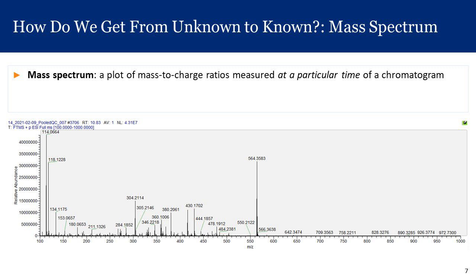And as I mentioned earlier, one of the great advantages of non-target analysis is really that we can detect large numbers of different compounds. But I hope it also becomes clear here how important it is to really take into account, are all these ions really coming from the sample, or are any of these ions potentially coming from any background, either from the analytical instrument or from the laboratory that we're in.